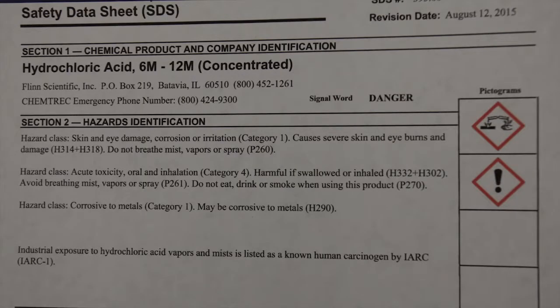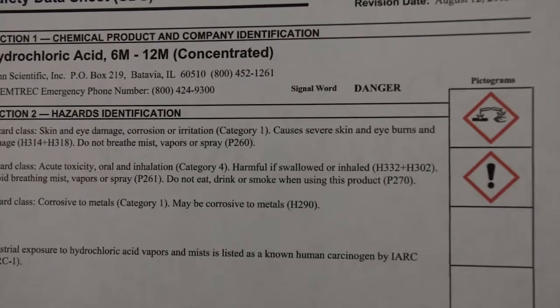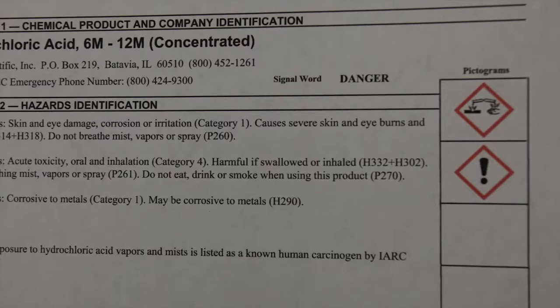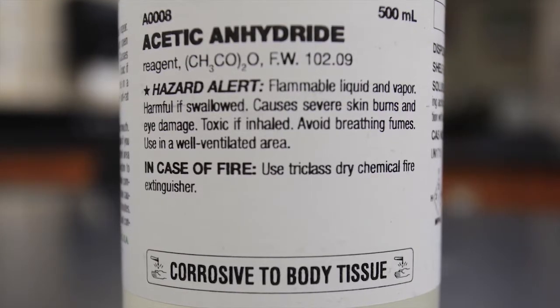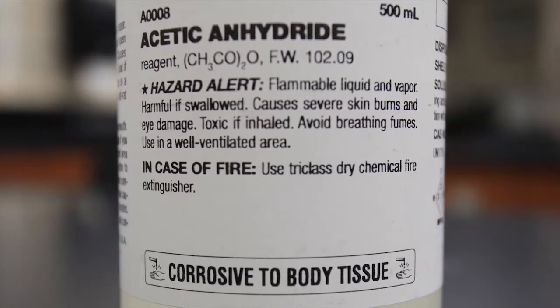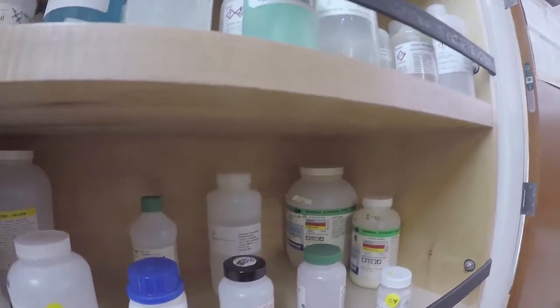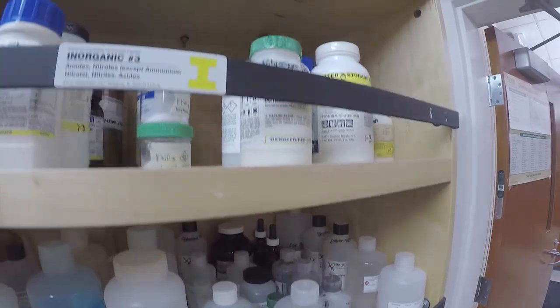We have arrived at the good old SDS, aka Safety Data Sheets and Labels portion of the video. An SDS will provide you in-depth information regarding potential hazards, proper handling, PPE, disposal procedures, plus much more. The chemical labels on the bottle will also state this information in a much more concise fashion. Making it a habit to read your lab handouts before class will give you the opportunity to look up the SDSs for the chemicals you will be using.